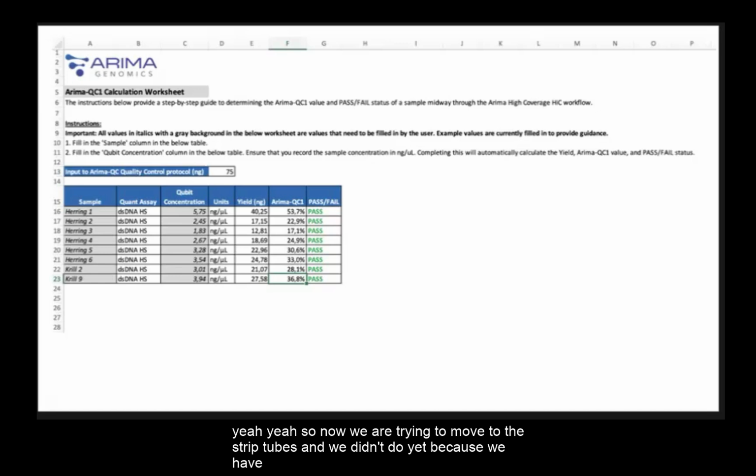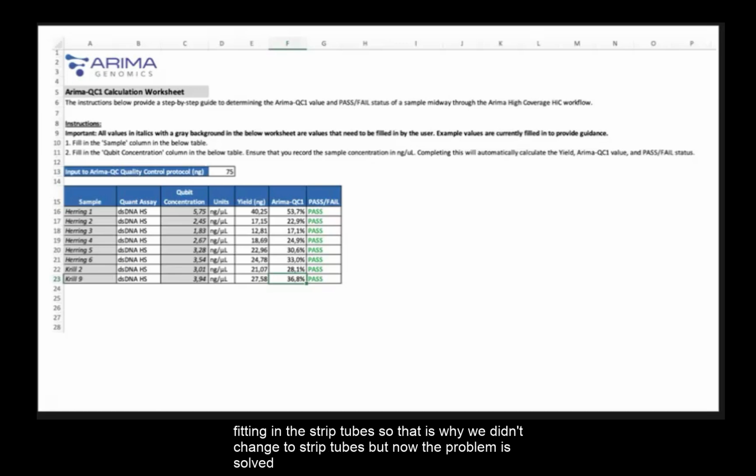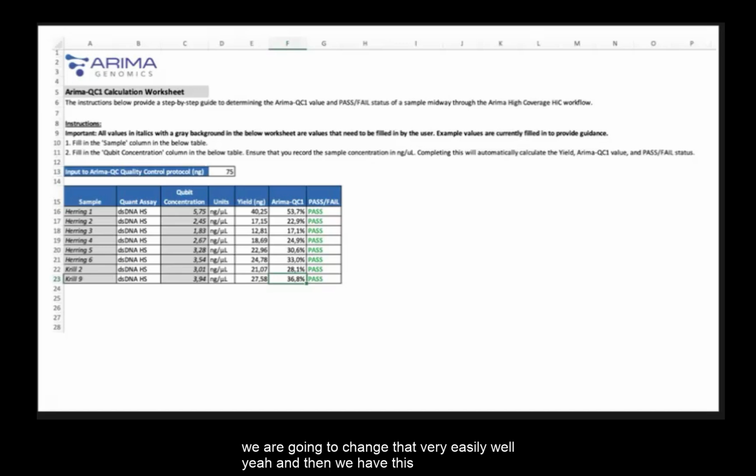So now we are trying to move to strip tubes. We didn't do it yet because we had that problem with estimating the input amount, which is something that we are going to change, because I don't know why we were working with 100 microliters of the estimating input amount. During that process, you have to pellet the 100. Everybody remembers that. When you have your big pellet and you have the tube with your estimating input amount, you have to pellet all the samples. In our group, we were working with the liquid, not with the pellet. So in the end, we had 300 and something that does not fit in the strip tube. That is why we didn't change to strip tubes. But now the problem is solved. We're going to change that very easily.